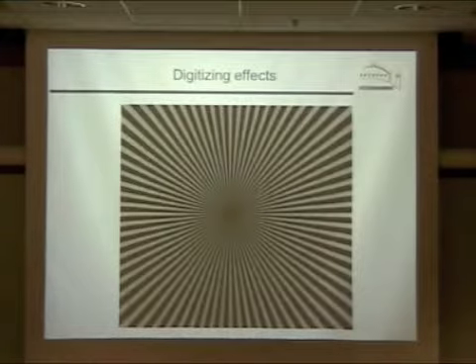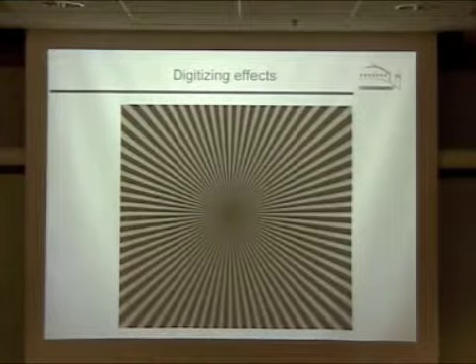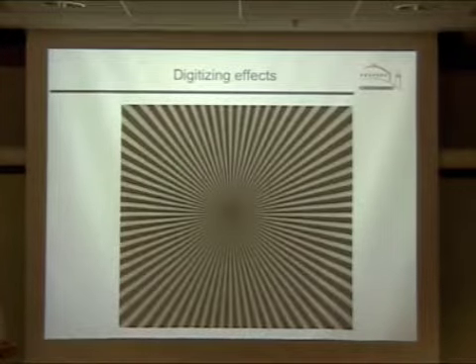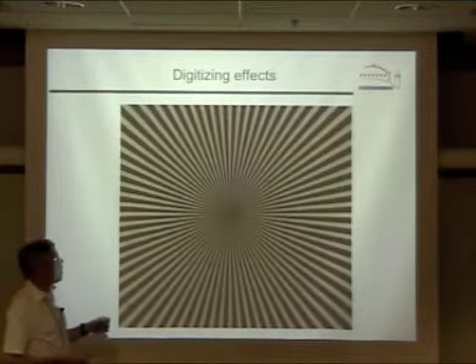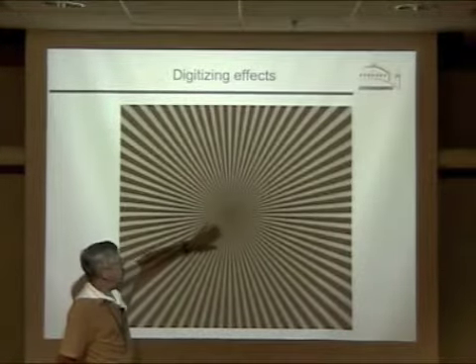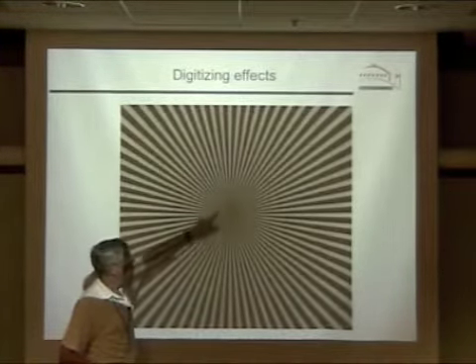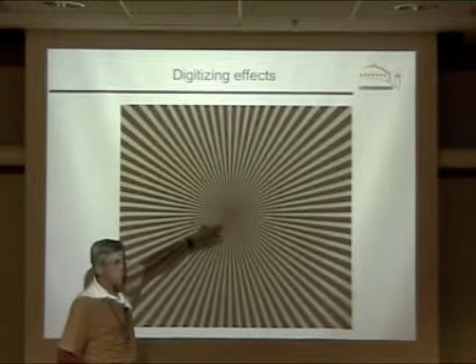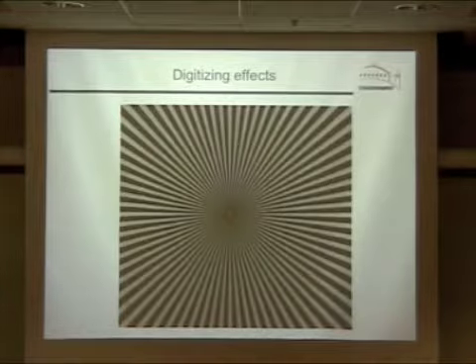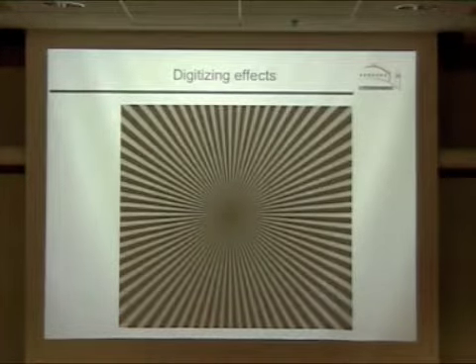We don't have control over the focus of the projector, do we? Okay, so we'll just ignore that. If we could defocus this, we would see all sorts of bizarre effects as the contrast would vary, would reverse in certain zones here. And you get all sorts of strange things that are similar to the contrast reversals that you get in the electron microscope. That wasn't the point.